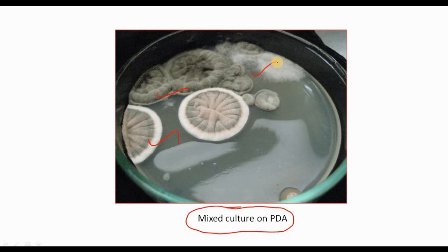Whenever we are stepping into microbiological research, the first step is to identify the organism. For identification of fungus we use a common procedure called microscopic identification, and this identification is not given priority in the field of research. But what people are seeking is to identify the fungus based upon its molecular makeup, which means molecular level. Molecular level identification is asked for by people across the globe. So for that purpose, we are going to isolate the DNA from the fungus, and we are going to sequence it in order to identify what fungi is growing in your Petri plate. Right?